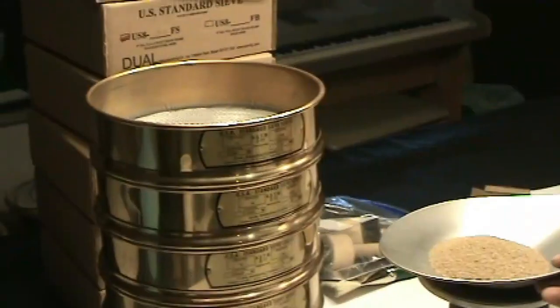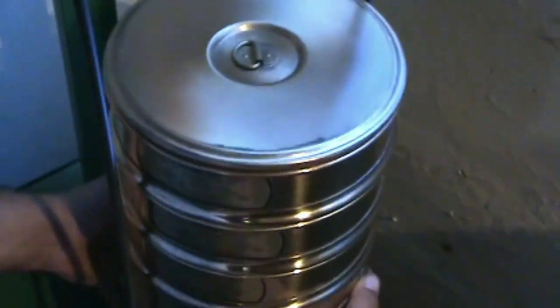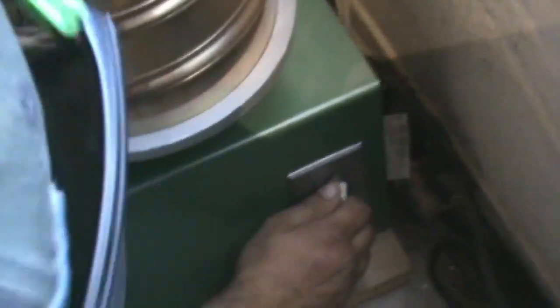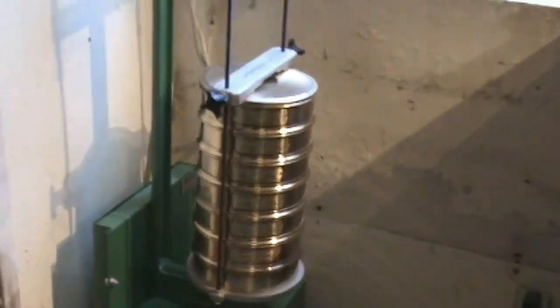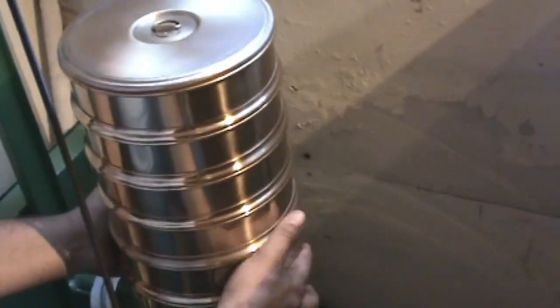Next, the sample is poured into the top of a stack of sieves, with the bottom having a pan. In this case, the first sieve is a number 12, having the largest mesh size, with the last being a number 25. Step number 3 is placing a cover on the top and securing the stack in the sieve shaker set for 10 minutes. Once time has elapsed, the sieves are removed and separated one at a time, with the remaining contents of each individual sieve weighed and recorded in our custom spreadsheet.